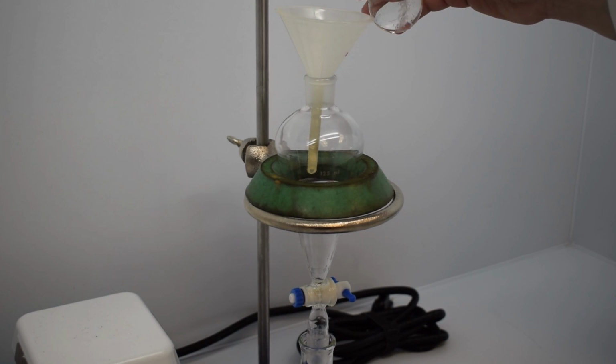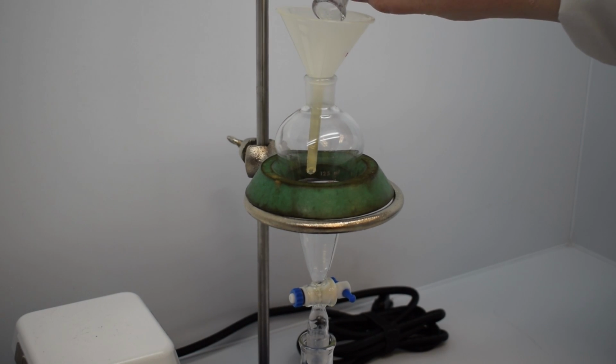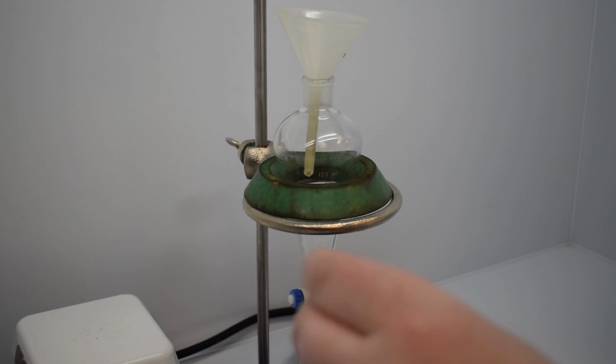Alright, so our synthesis step is complete, the smell of bananas is strong in the air, and we're ready to move on to our extraction, which is the first purification step. The reaction mixture from the round bottom flask is transferred into a separatory funnel, and then that same flask is also going to be rinsed with a couple milliliters of diethyl ether.